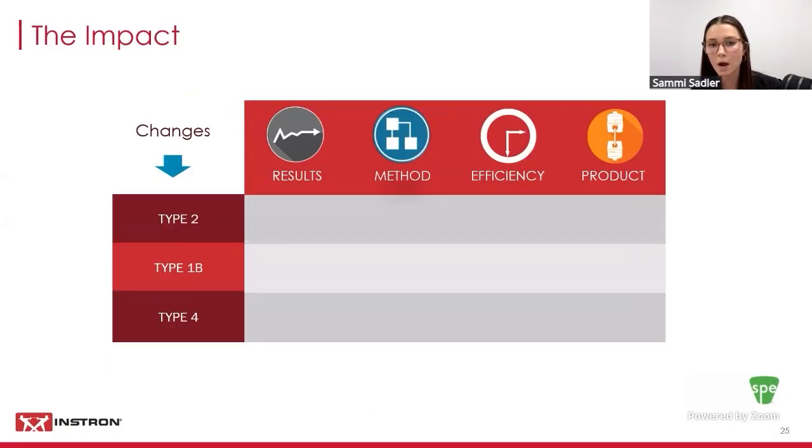So looking at how this will impact you, these updates will impact the dimensions of your material. If you are testing with any of these specimen types, the die that you use must be updated to meet the 2018 requirements. The method will also require an update for the specimen type 2 and type 4 to include the update of the grip separation. So once these are updated in your methods, just like the previous one, you can use that for the rest of your methods.